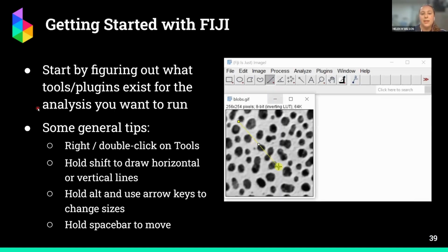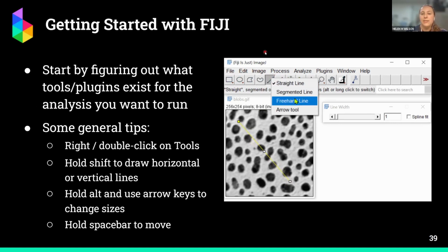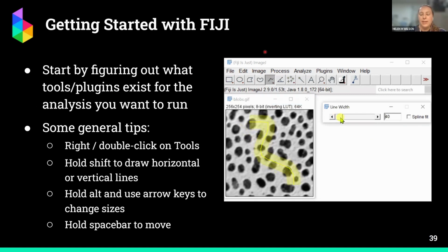So to get started, once you download it, you end up with this kind of toolbar where you have file, edit, image, process, and then these rectangle and line tools. That's the main functionality of the Fiji window. In this, you have a lot of different menu actions and filters and different things that you can apply to your window. You have different tools for selection.